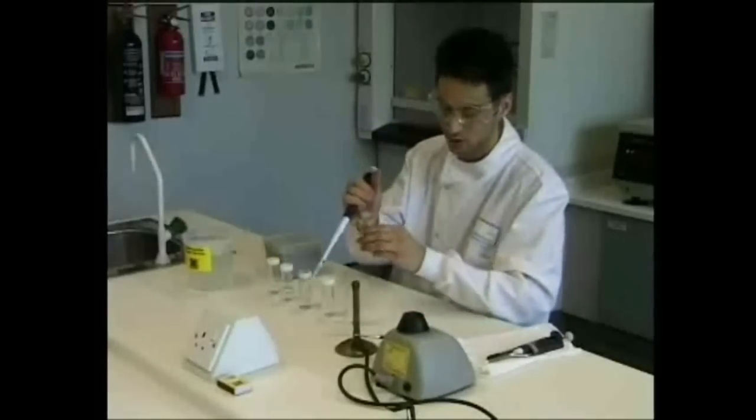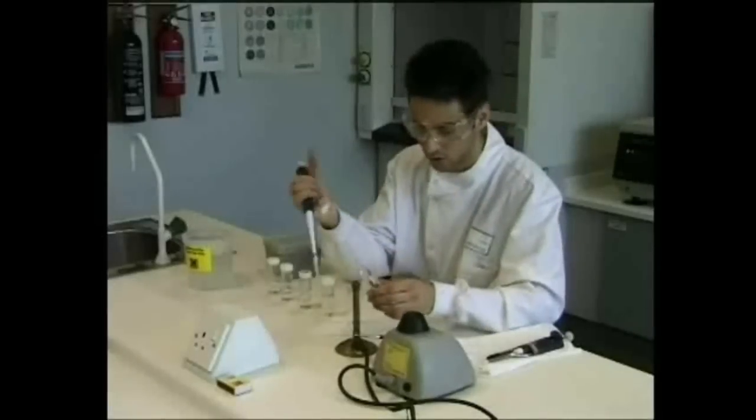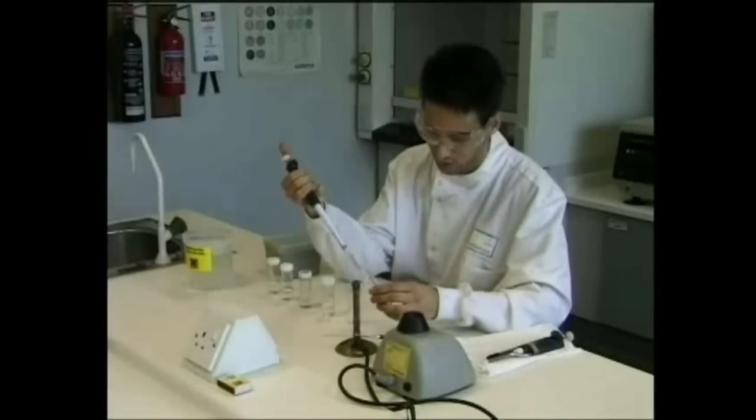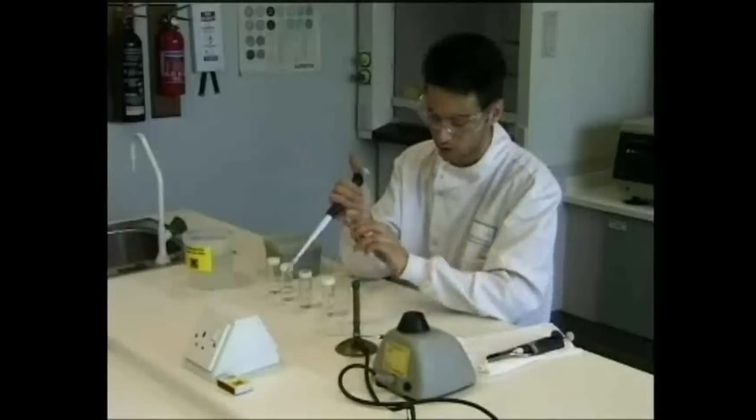For example, wearing safety glasses or gloves, dealing with spillages and disposal of contaminated waste, and you'll need to be aware of these procedures before you start work.